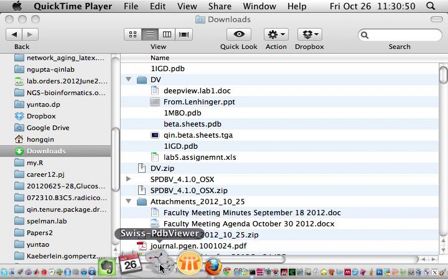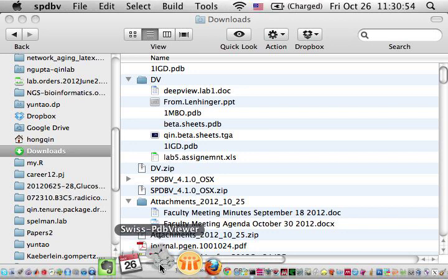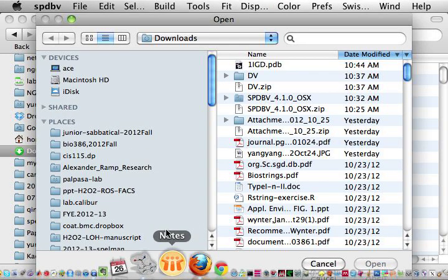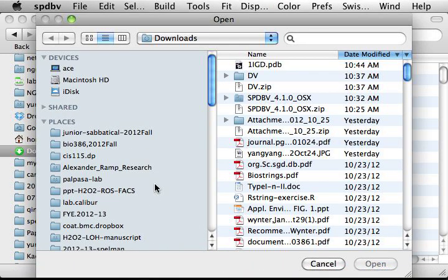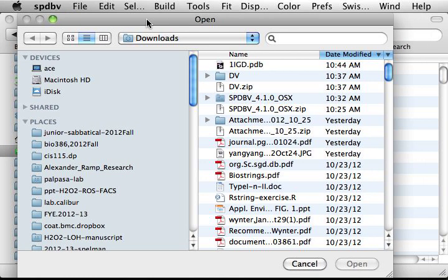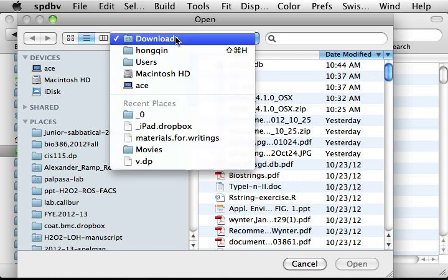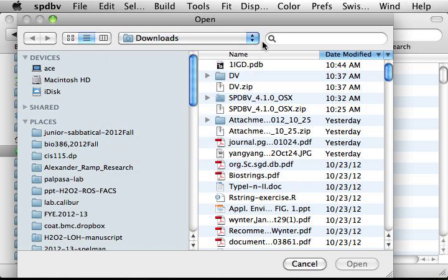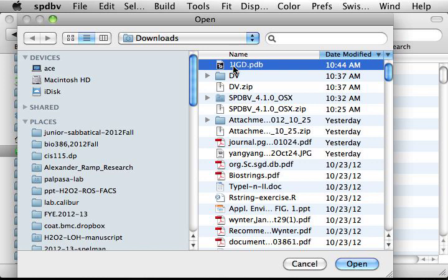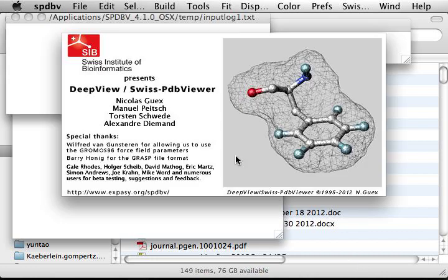So let's first start Swiss PDB Viewer or DeepView. The new version of DeepView 4.1.0 starts by directly going to the open file window. In this case, make sure you go to where your PDB file is. In my case, I go to a download folder for the PDB file, that's the 1igd.pdb file. Download it, so I then click open.